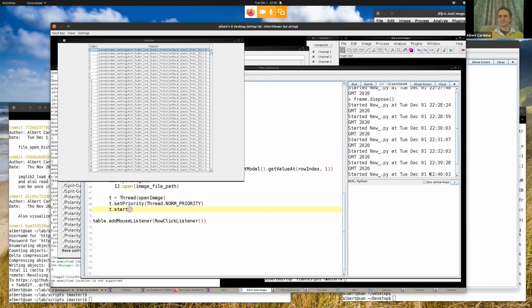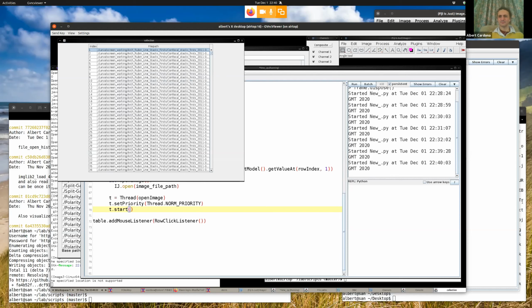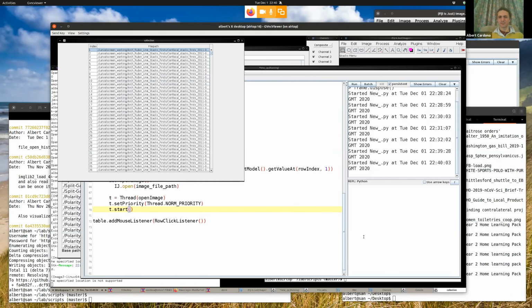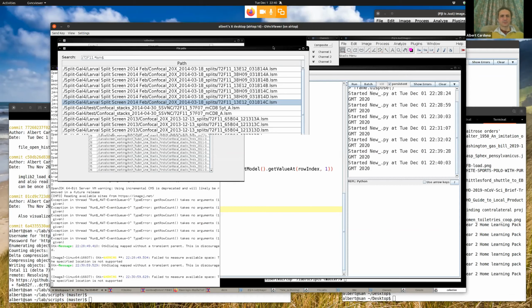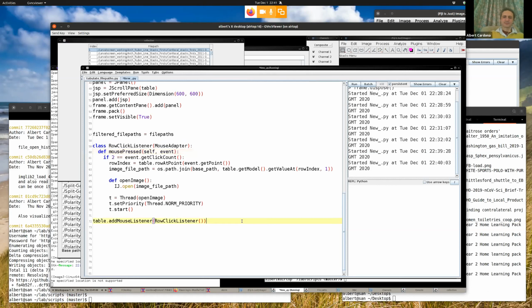I'm not sure. Did anything happen? Where is Fiji running? No, that's not the wrong computer. Is it running here? Yes. And nothing happened. This could be a file that Fiji doesn't know how to open. So, OK, you see, we have a problem. We need a proper layout, because otherwise we cannot even read the files that we're looking at. All right, let's fix the layout.